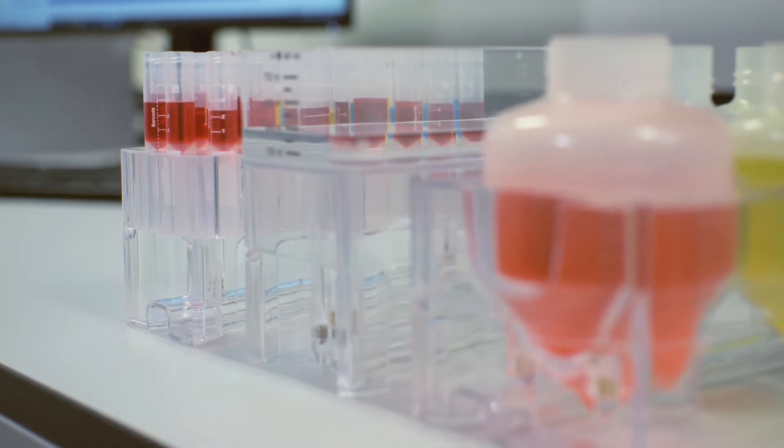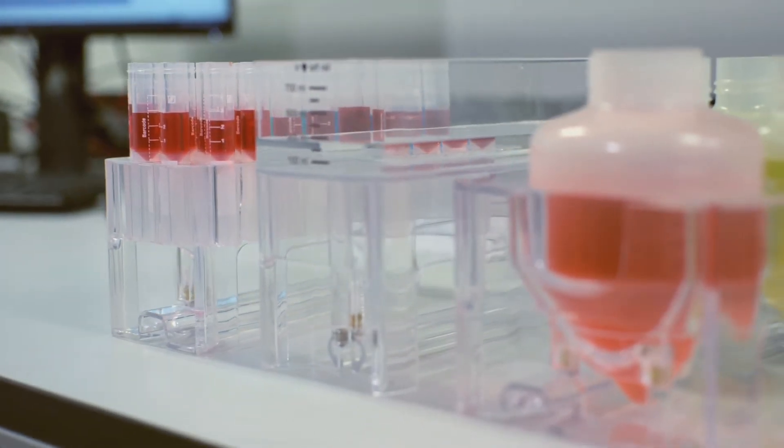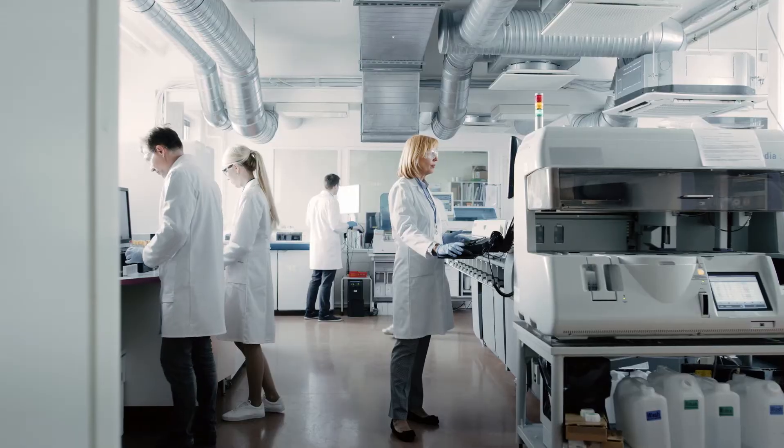Tubes with reagents are held in a separate tray that can be loaded to allow for maximum flexibility in a research lab.